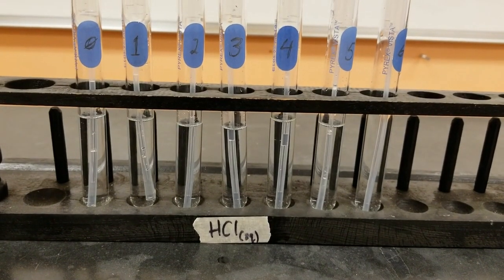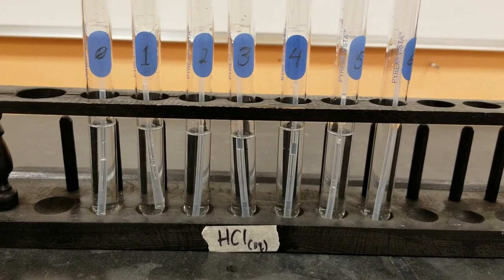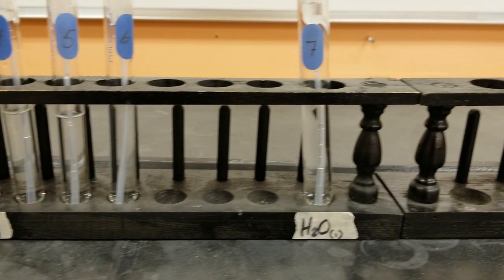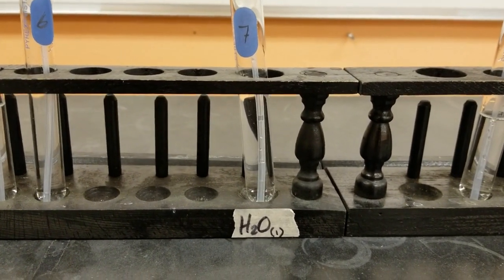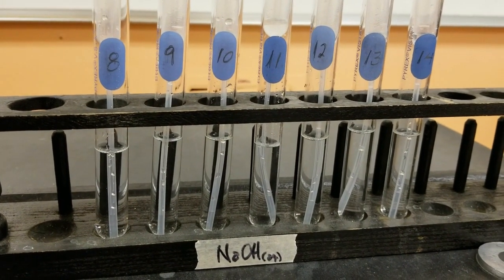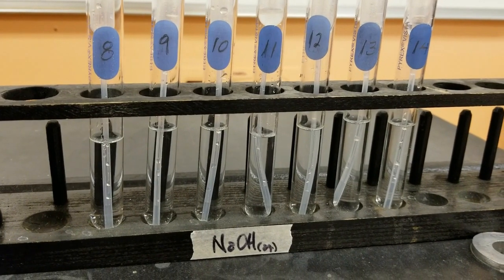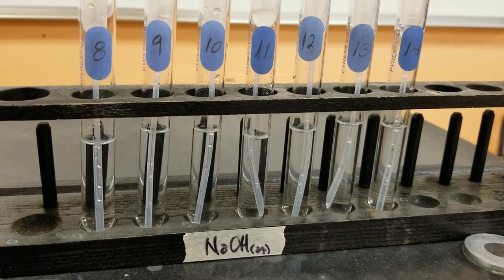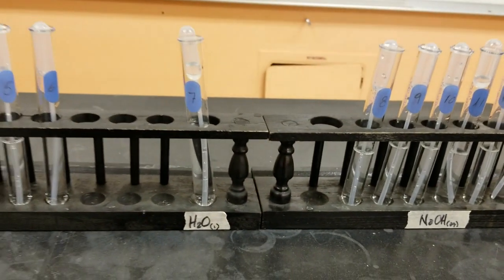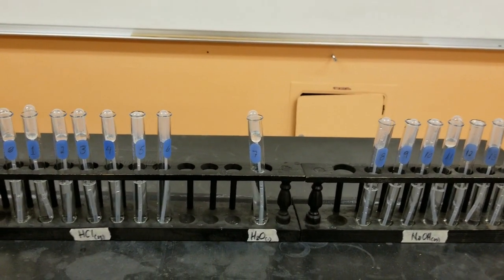So now we've got all of our test tubes made: 0 through 6, all HCl, decreasing in their concentration. Test tube 7 is distilled water. And test tubes 8 through 14 are increasing in concentration of sodium hydroxide, with 14 being the most concentrated. What we're going to do now - because these solutions really look very similar and you can't tell much difference between them - is look at color change indicators for acids and bases. I've picked three very common ones: we're going to see bromothymol blue, phenolphthalein, and one called universal indicator. To do that, I'm going to be putting drops of these different solutions into well plates and then adding some of the indicator to them.